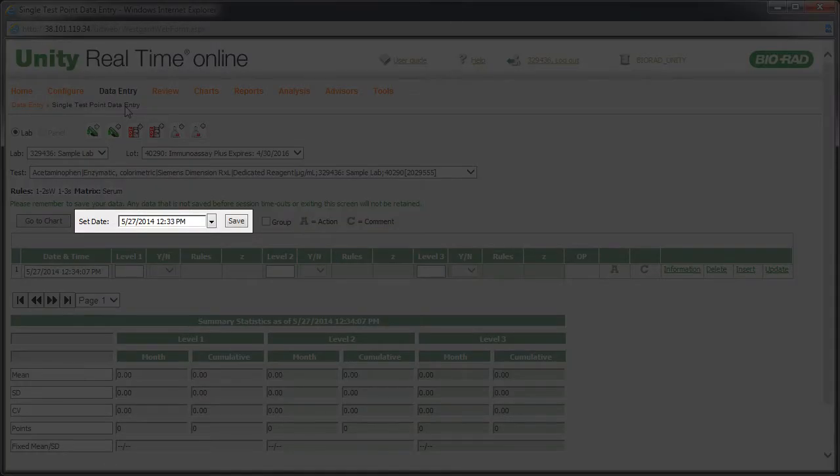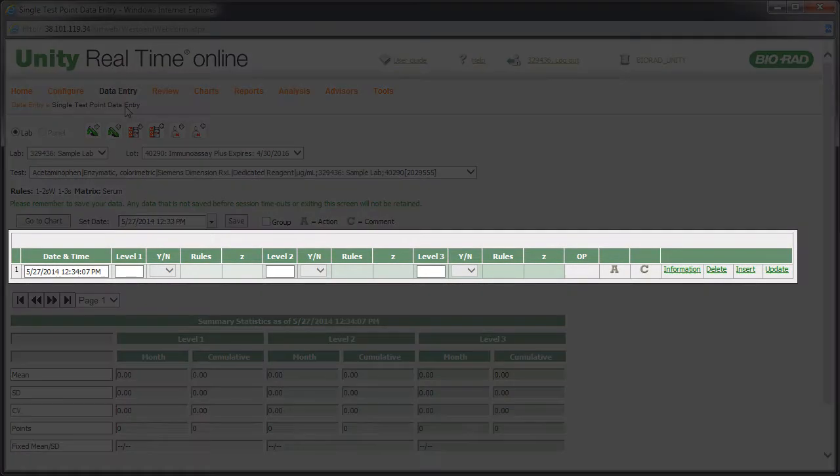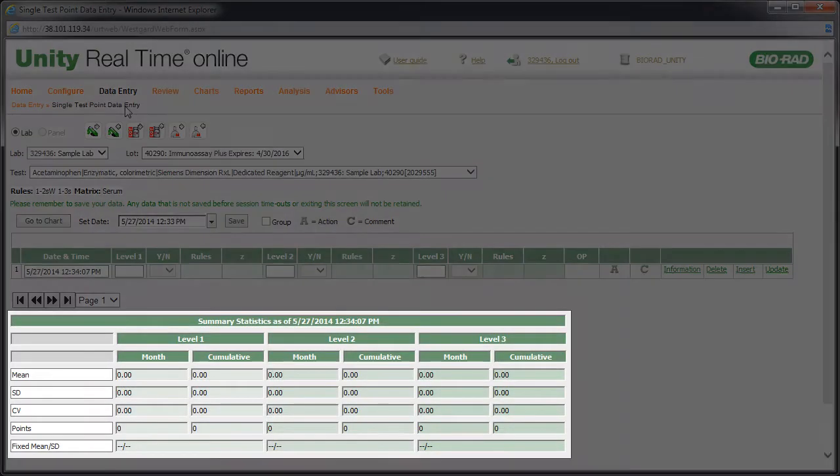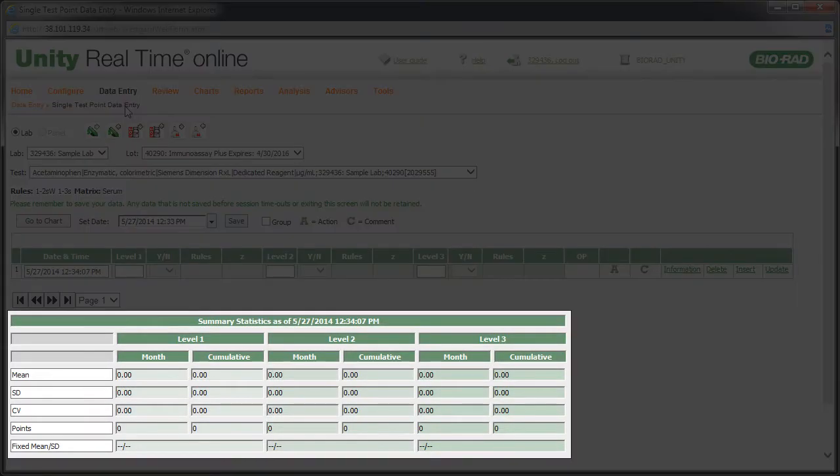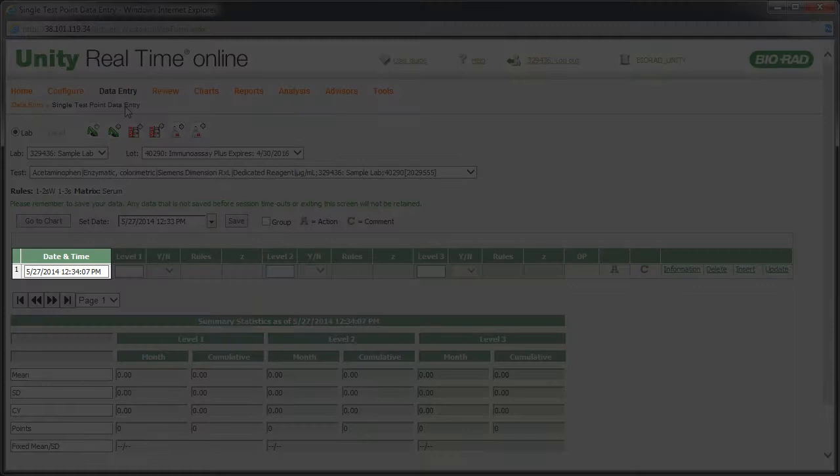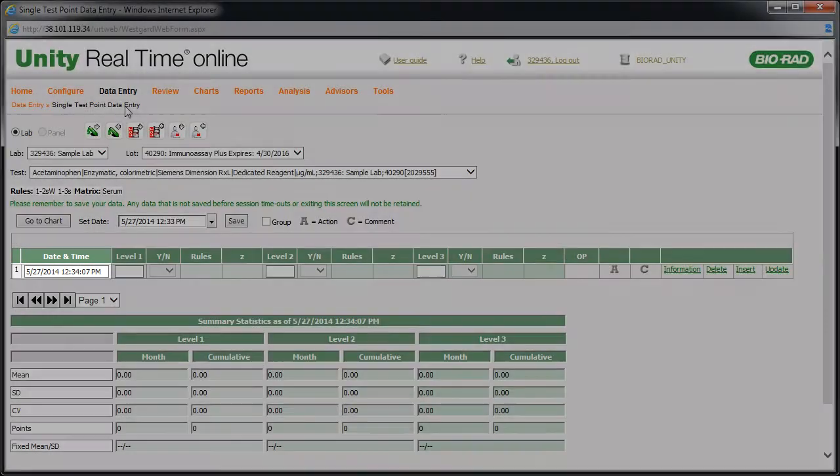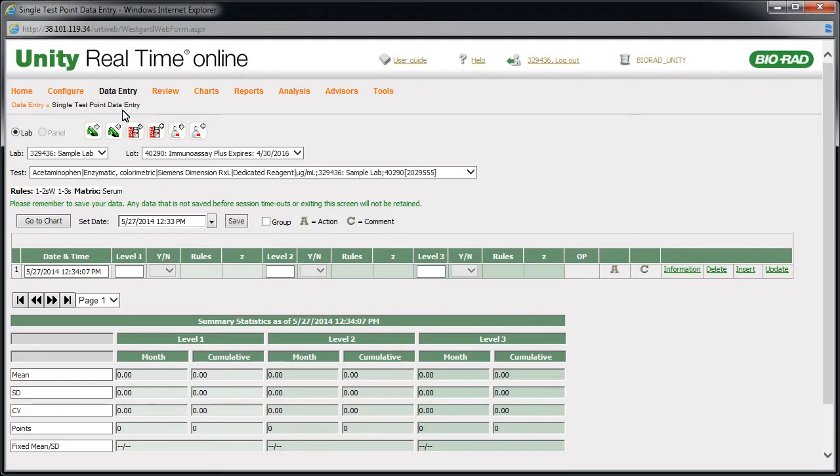Here you're able to select a date. Data is entered here. Cumulative statistics can be accessed here. To enter data, you'll need your date. Then enter your first value.